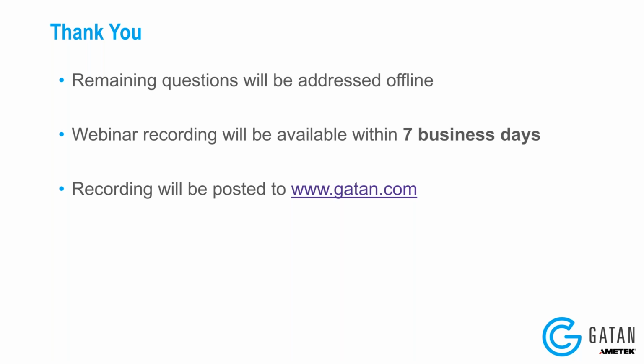What I'll say is that there's no one camera that is good for every application out there. The ClearView camera and scintillator cameras are really good cameras for people who are trying to do a lot of different things on their microscope. But as soon as you feel like, oh, I need better sensitivity for low dose imaging, then I would always suggest taking a look at a direct detection camera. And as soon as you think, oh, I need the ultimate speed and dynamic range for my 4D STEM experiment, then I would say take a look at Stella and hybrid pixel cameras.